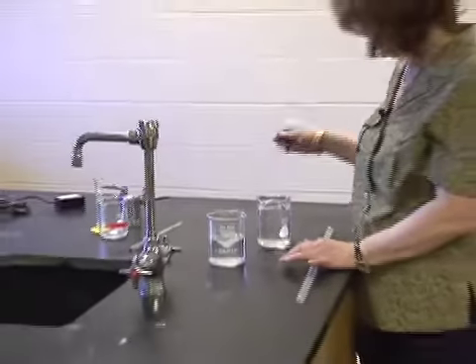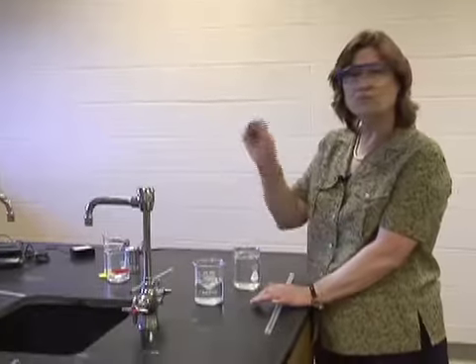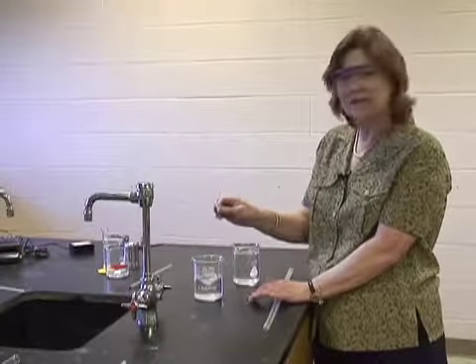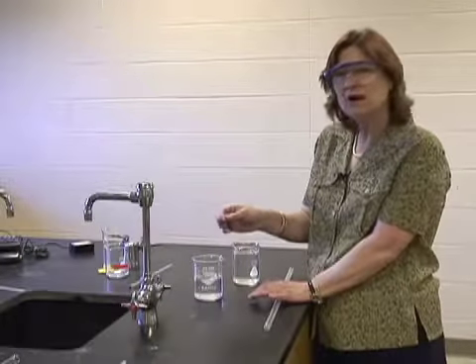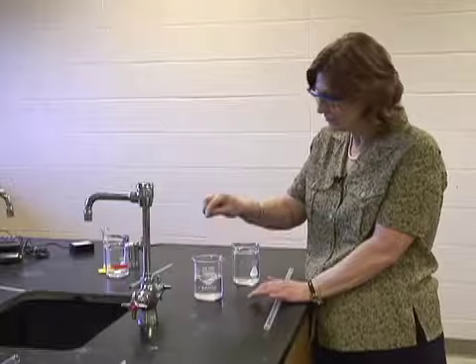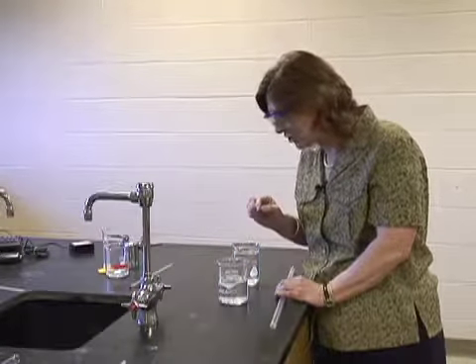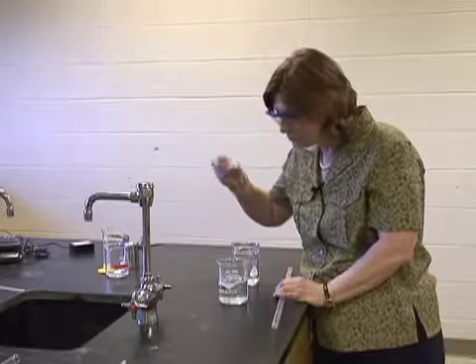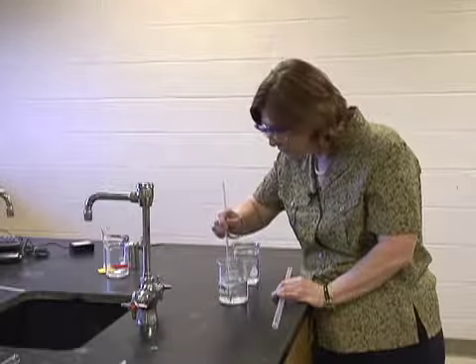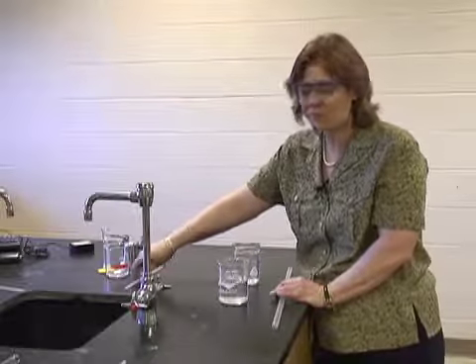Now I'm going to take the magnesium that I have and throw it into here because I want to break that surface tension, just like if I was diving off a diving board. I'm going to break the surface tension, and it went to the side of the beaker, but that's okay. I can still get it. Or I can actually move it to the center with my thermometer. But I don't worry too much about that.